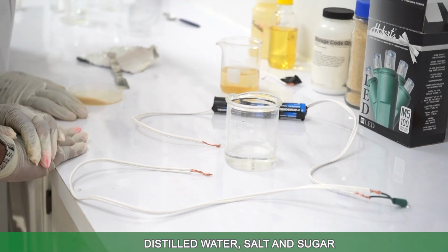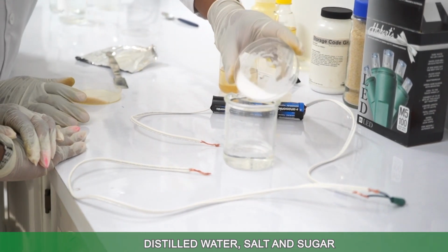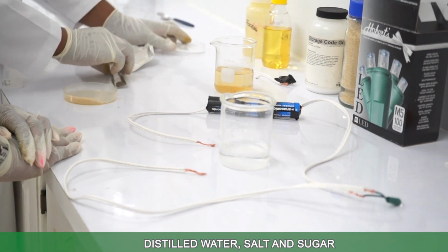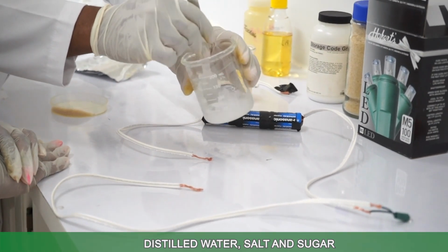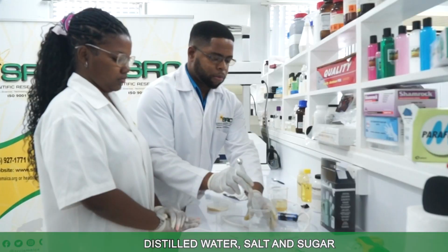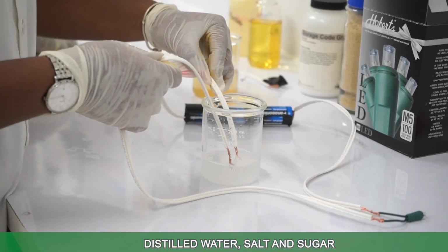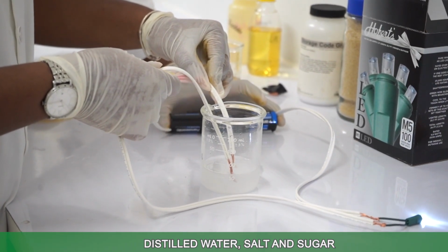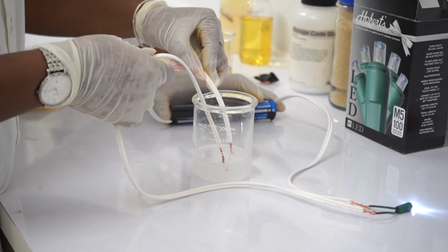So let's try the salt. Remember that in the solid form, salt did not conduct electricity. We'll try it in aqueous solution. Essence, if you may. Alright, so this time it conducts electricity.